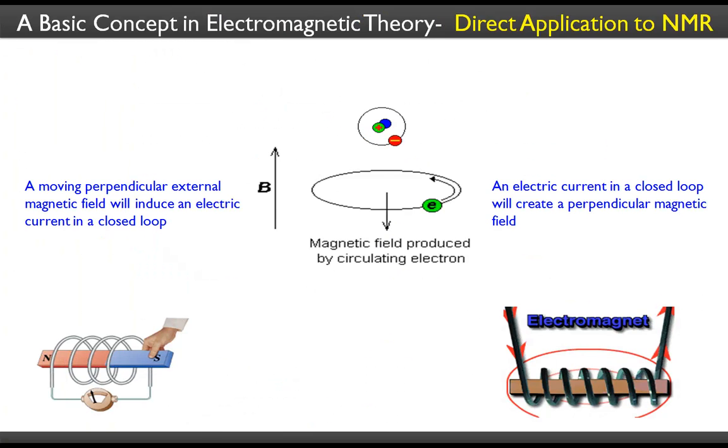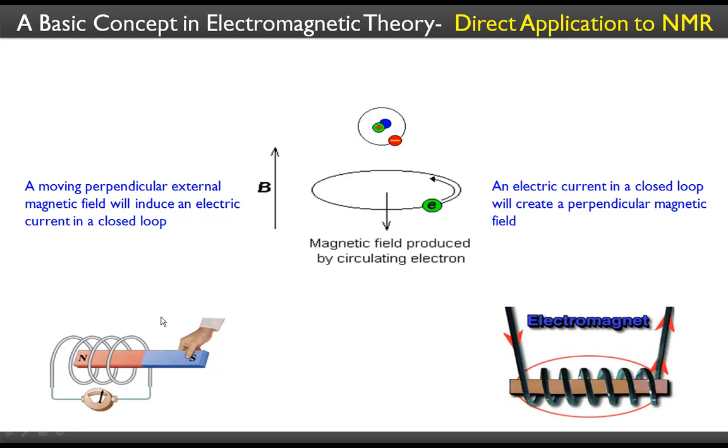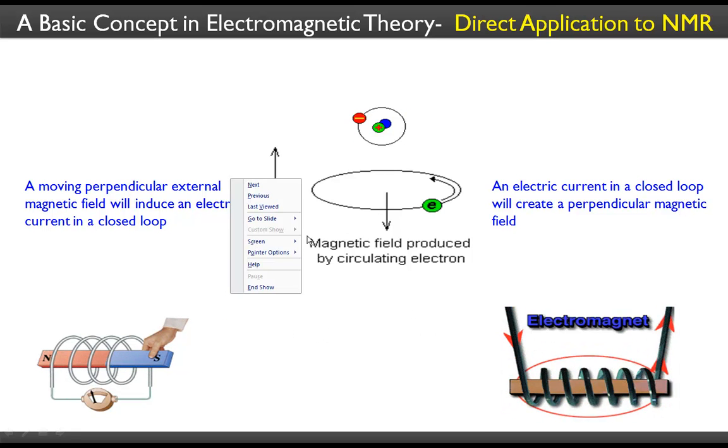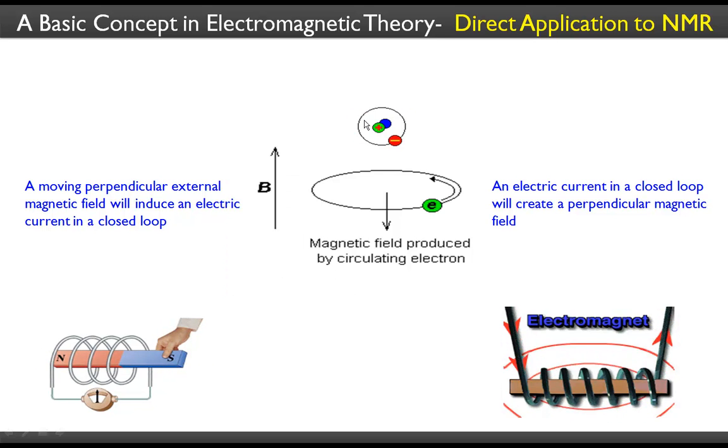So today we are going to talk about C13 NMR spectroscopy. If an atom or nucleus doesn't have spin, it would not generate a magnetic field. In order to generate a magnetic field, as we talked about in terms of physics, it should have a spin of its own. The spinning electrons, as you can see here, the current which goes in the loop would produce a magnetic field.